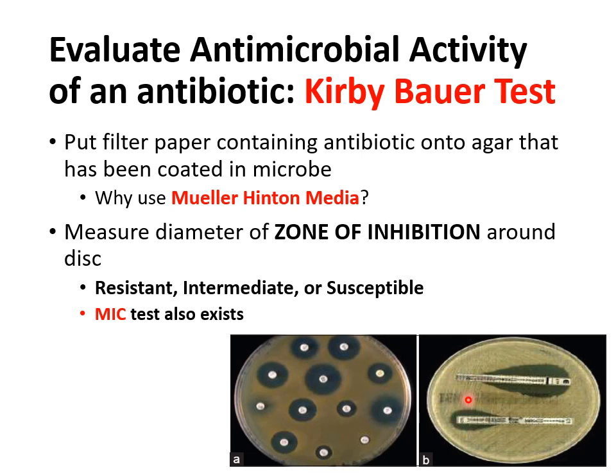Okay, this one down here has a much higher minimum concentration, meaning that you need to use quite a bit of this antibiotic before you actually get any killing of that bacteria. So looking at this picture, you would prefer to choose this antibiotic rather than that one, and you would choose a range within the zone of inhibition. Okay, so that's the MIC test, it gives you the exact minimum range to be able to use to kill the bacteria with that antibiotic.